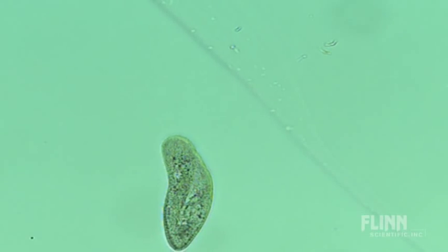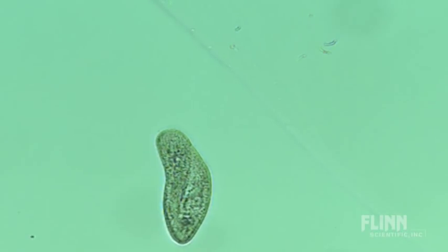You can use a vital stain and watch the pH within the digestive organelle change from base to acid as it eats its prey.